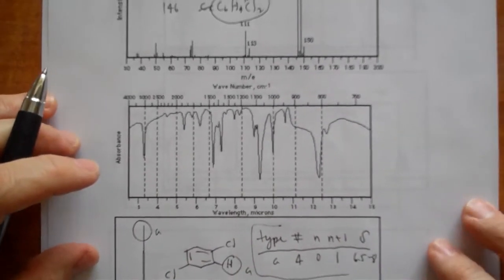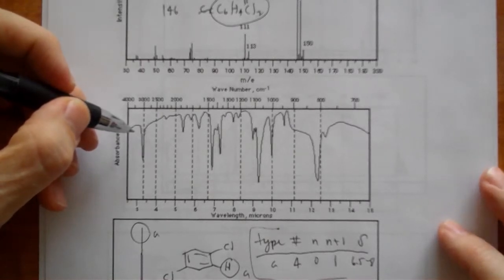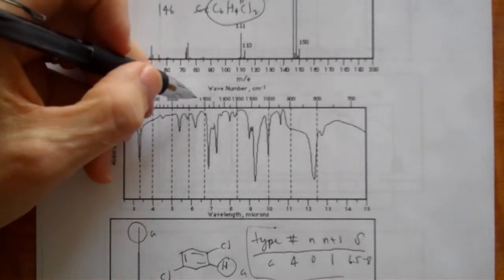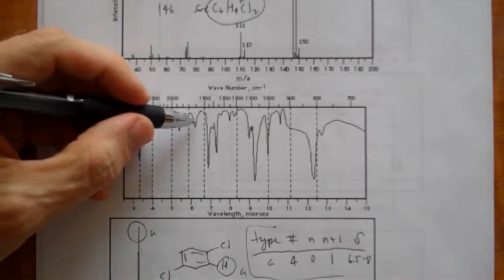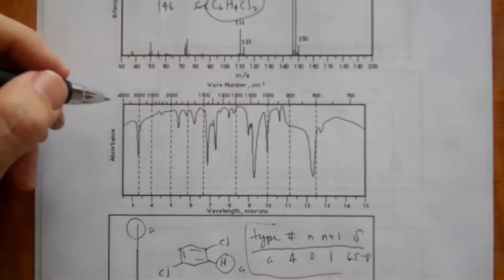Alright. Now, we go here and we see that we've got a benzene ring, so we're expecting peaks at 15 and 16, and they could be these two shifted down a little bit. What's that? 13? Could be 14 and 15, possibly.